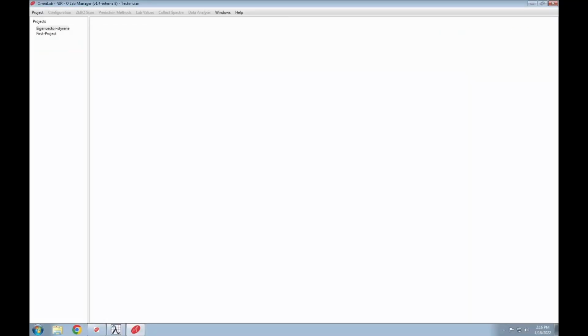In this OmniLab video, we're going to discuss SMS, the Stability Monitoring System. SMS helps track the performance of your analyzer over time. SMS works by scanning a known material and then computing certain values from the spectrum and comparing them to the performance limits that we allow on those quantities.